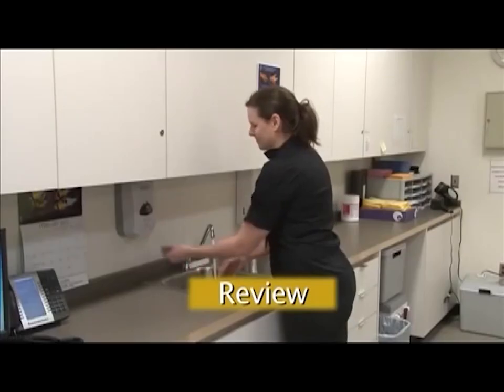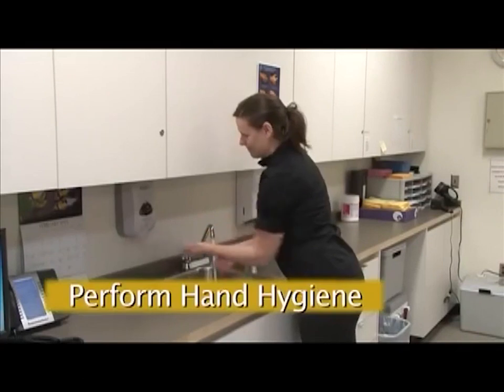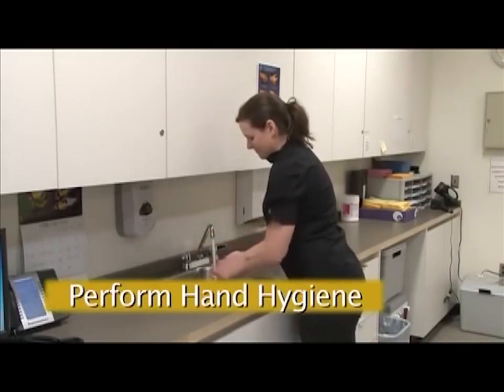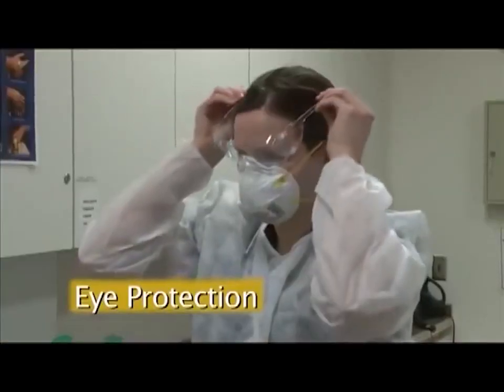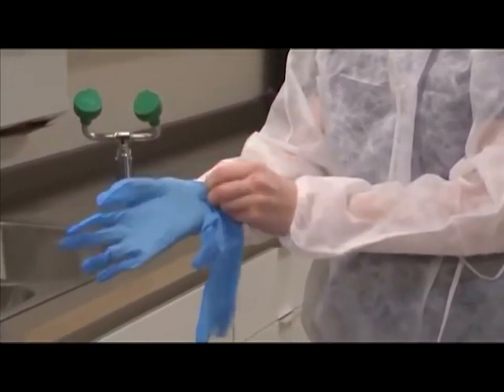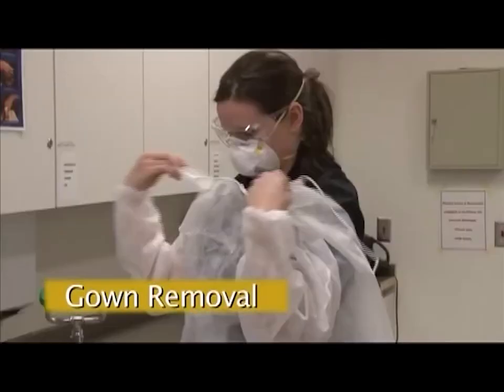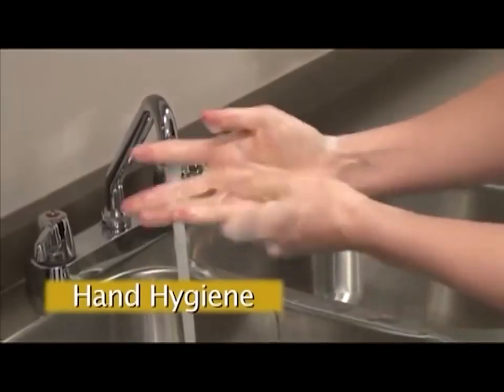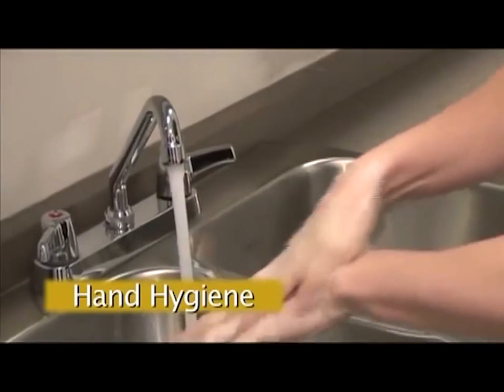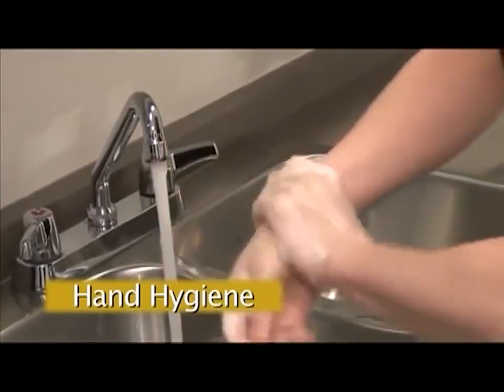Let's review all of the steps for putting on and taking off personal protective equipment. First, perform hand hygiene. Put on your personal protective equipment in the following order: gown, mask, eyewear, and gloves. Remove your personal protective equipment in the following order: gloves, gown, eyewear, and mask, remembering not to touch contaminated surfaces. Perform hand hygiene after removing gloves and gown, and again after taking off eyewear and mask.